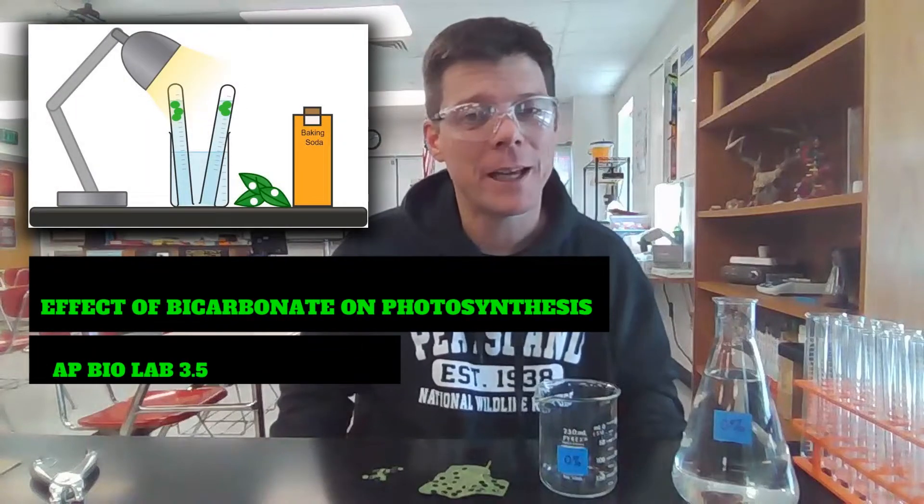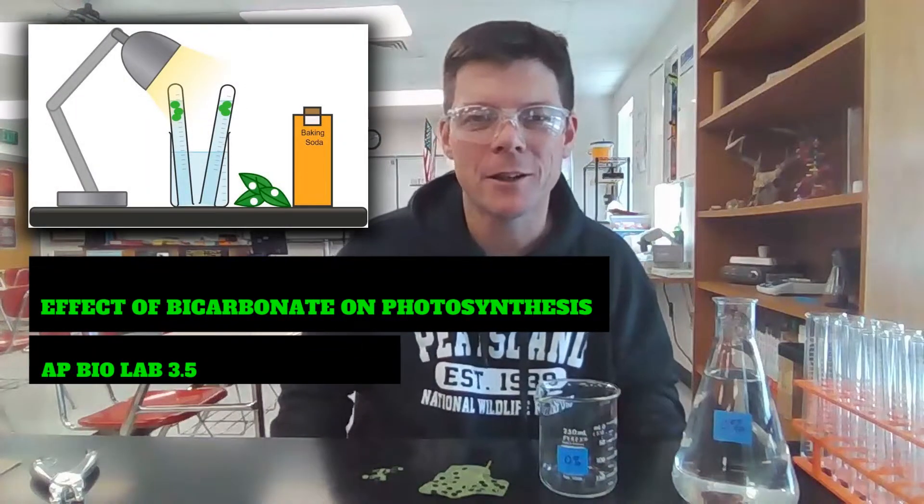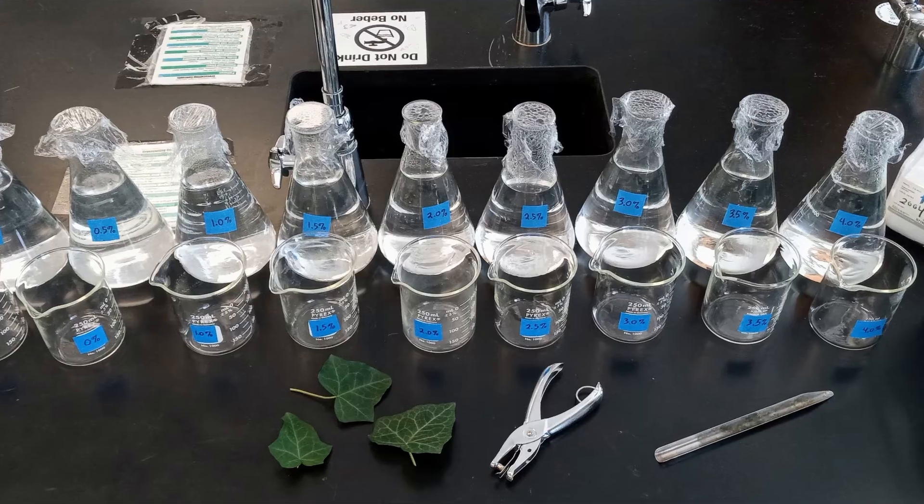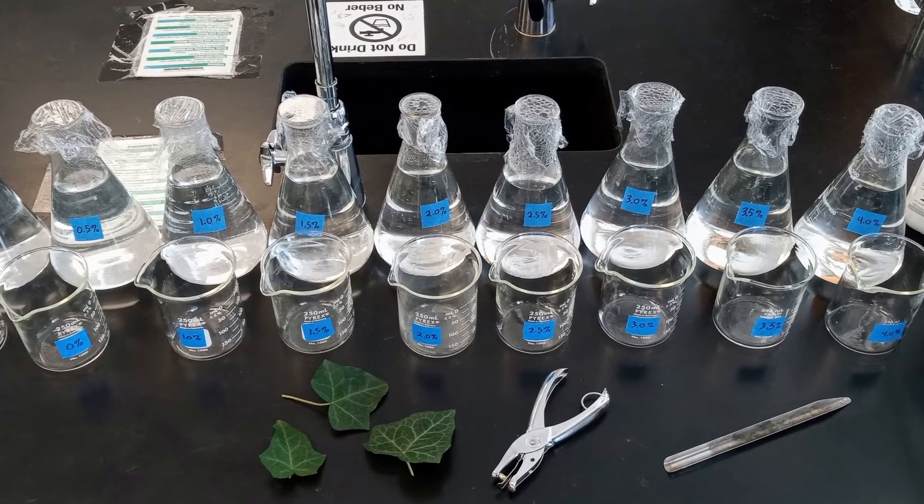Hey biology friends, it's Mr. Pauler again. In this video, we will be taking a look at a photosynthesis experiment for AP Biology. This is an alternative to the classic floating leaf disk assay. Let's take a look at the materials you will be using to set up the experiment.